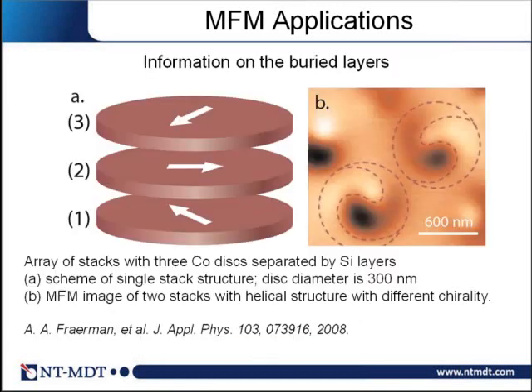Our next example is connected with investigation of multilayers. As I already said, due to the non-locality of magnetic fields, the dipole fields which you are sensitive to, you can investigate the magnetic properties not of the surface layers, but of the buried layers, which is shown here.